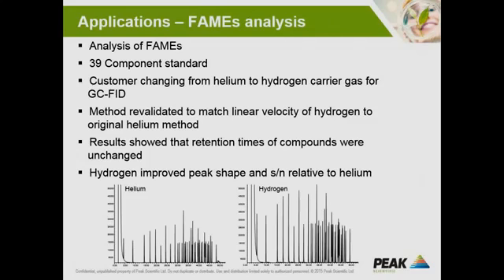As you can see from the two chromatograms at the bottom, the retention times are unchanged, but the advantage is that the efficiency is improved when using hydrogen, so the peak shape is improved and there's a better signal to noise relative to helium.